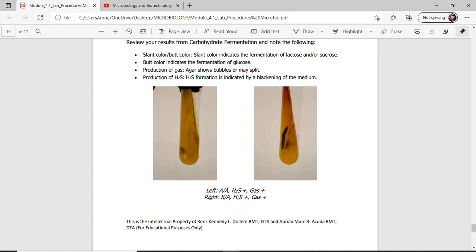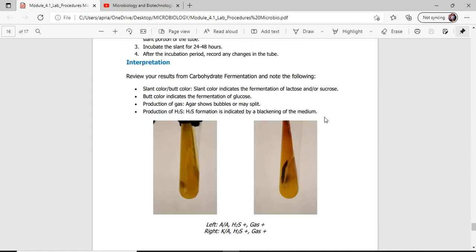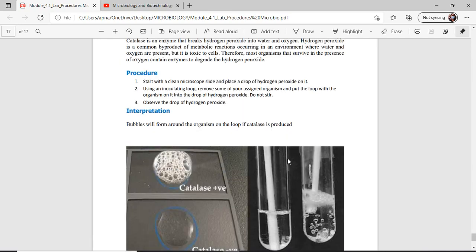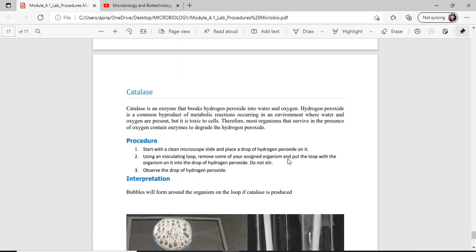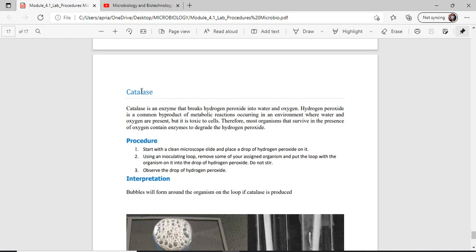So right side. What I did was I labeled the organisms out of the first experiment. The catalase test we use in class for differentiation: Staphylococcus and Micrococcus should be catalase positive, the enzyme that breaks peroxide into water, and Enterococcus and Streptococcus pyogenes should be catalase negative. If you look at the grand scheme of things, most everything is catalase positive except for strep and Enterococcus.